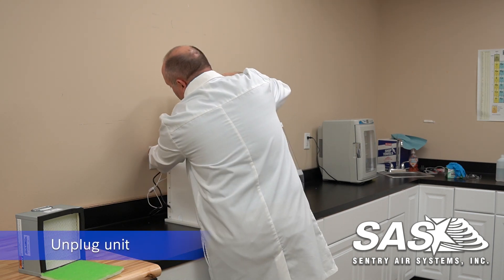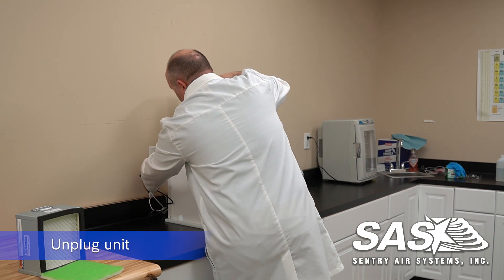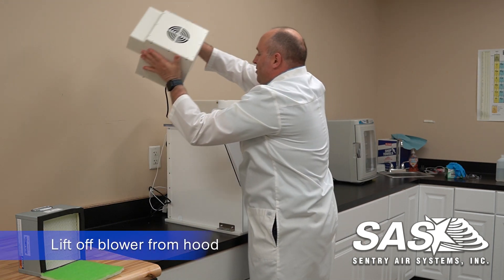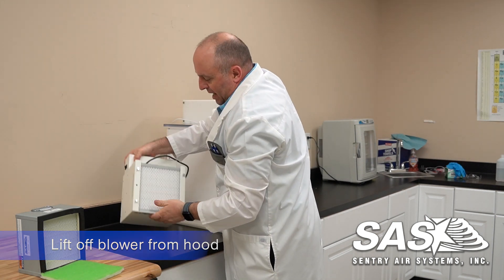From here we're going to unplug the blower and the light. Once that's done we can lift out the blower from the top here and set it on its back.